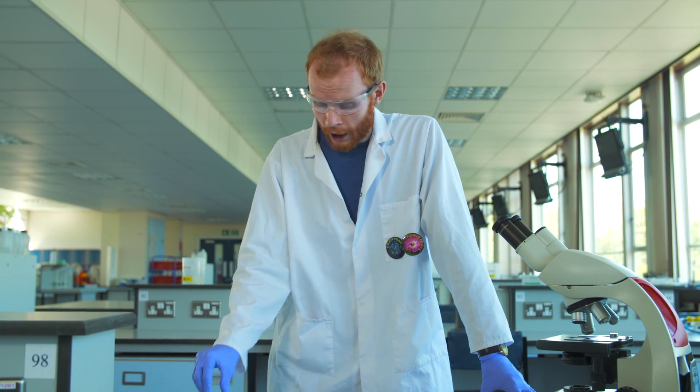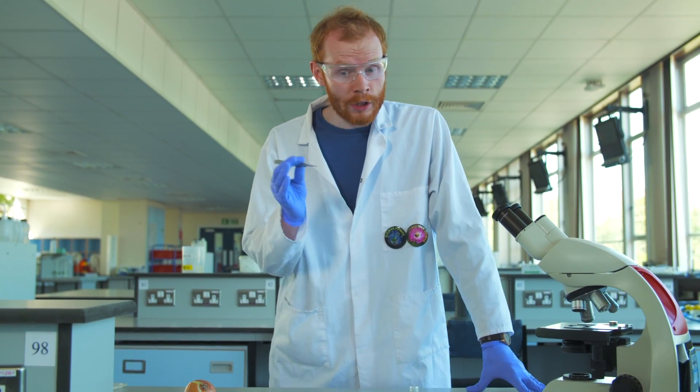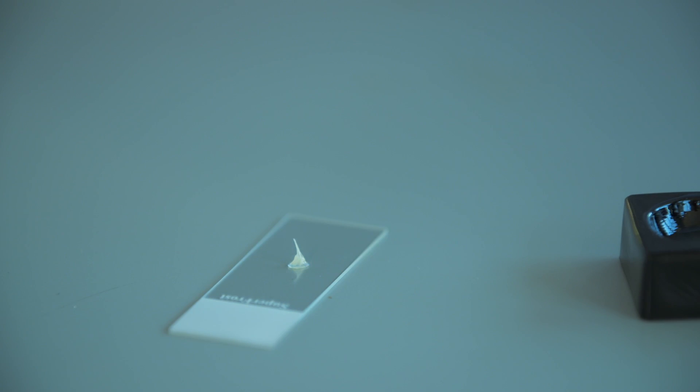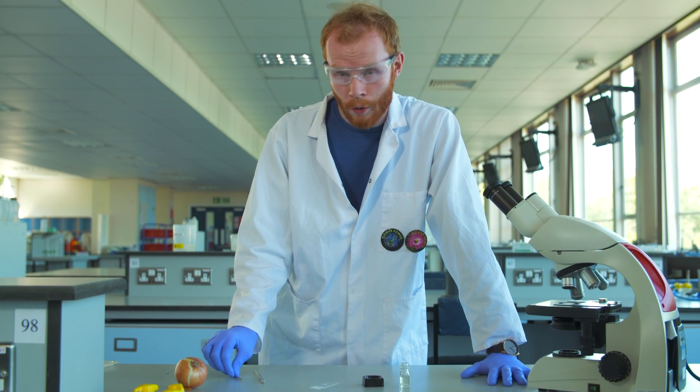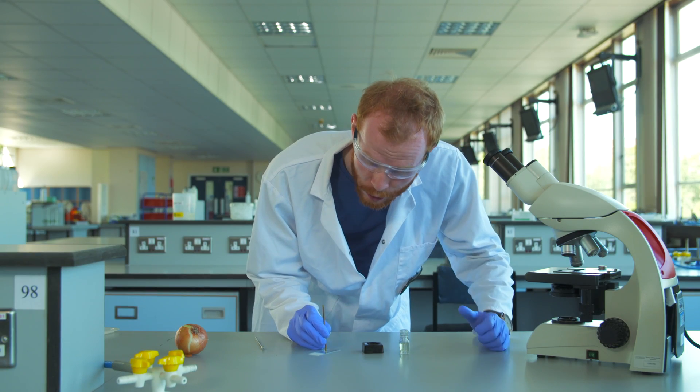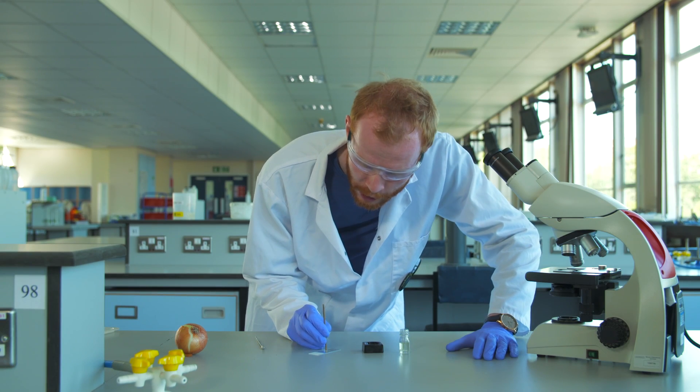Now if we were doing this with onion roots, we could use hydrochloric acid at this stage. Once our buds have been digesting for the desired amount of time, we can take them out of our enzyme solution using a pair of fine forceps and place them on a slide. Then using either a mounted needle or a brass rod, we can gently macerate our tissue to break it up into individual cells that we'll be able to see down the microscope.